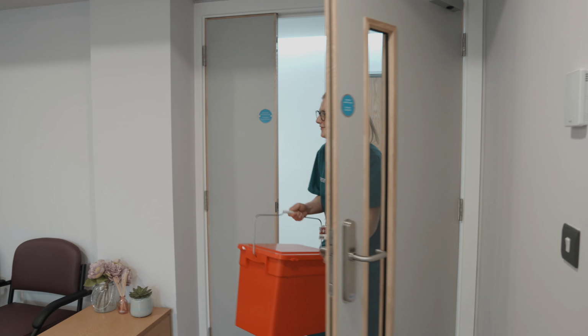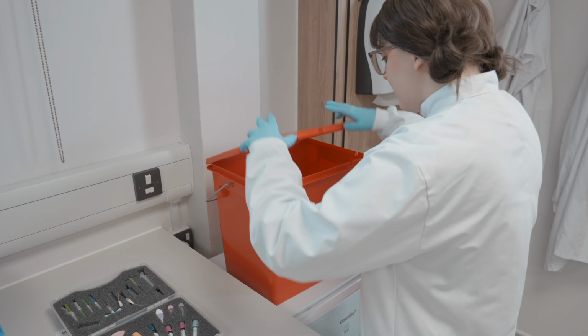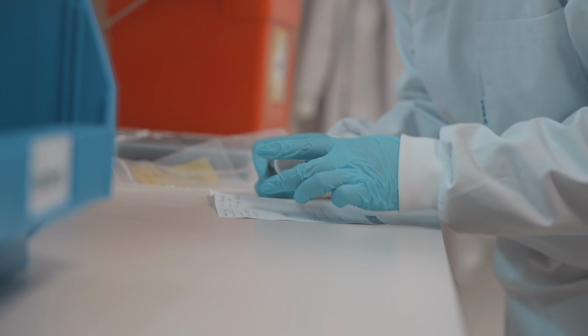The students are going through a sample reception scenario where they'll be receiving a box full of samples to sort through. They'll compare the details on the form, patient sample, to confirm that we know it's the correct sample and that we know where to return results to.